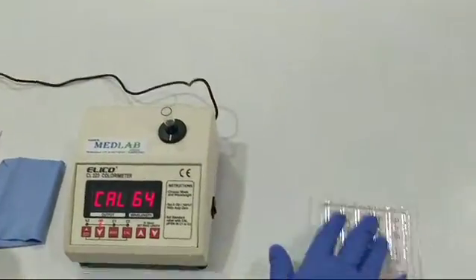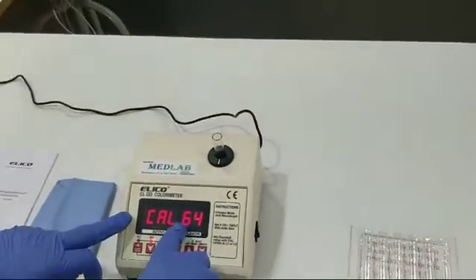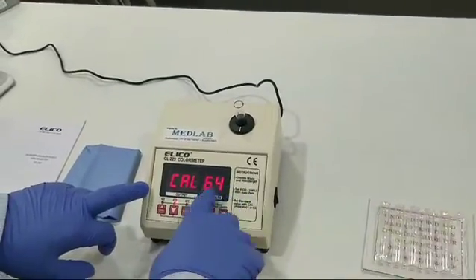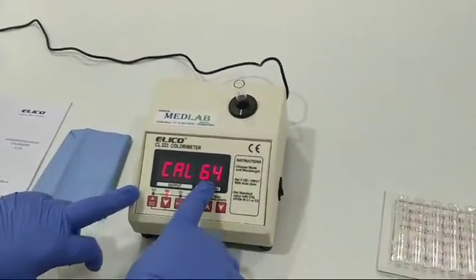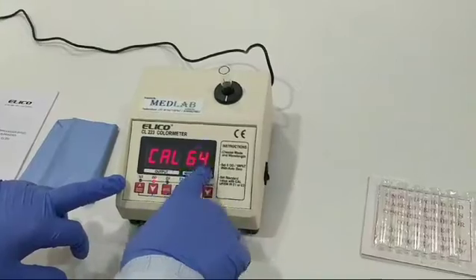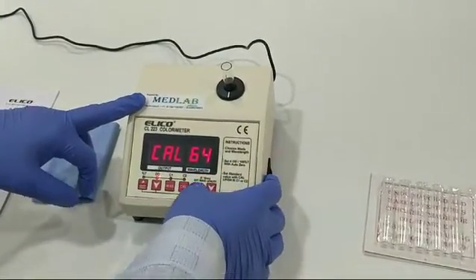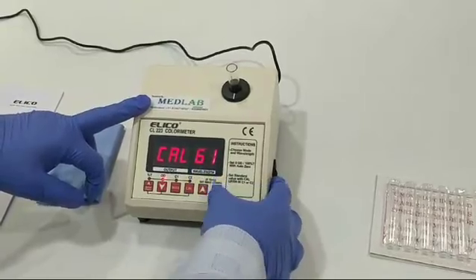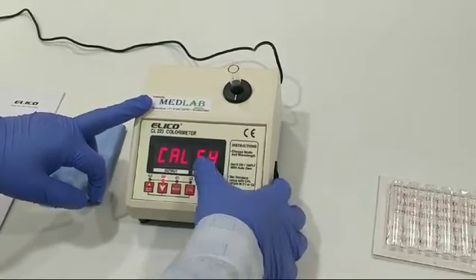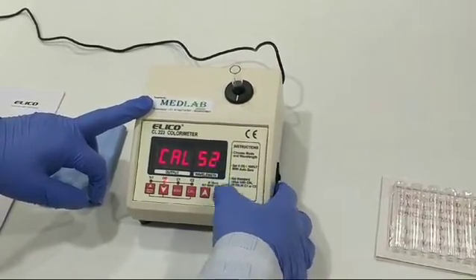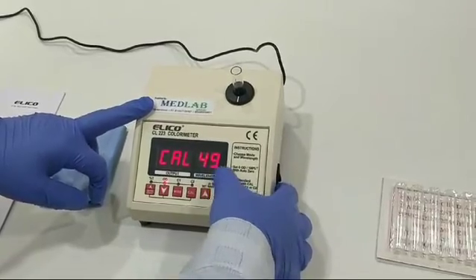In this device, no complete wavelength is written, only 64, which denotes 640nm. Then you get 610, 580, 540, 520, 490, 470, 430, and 410nm wavelengths.